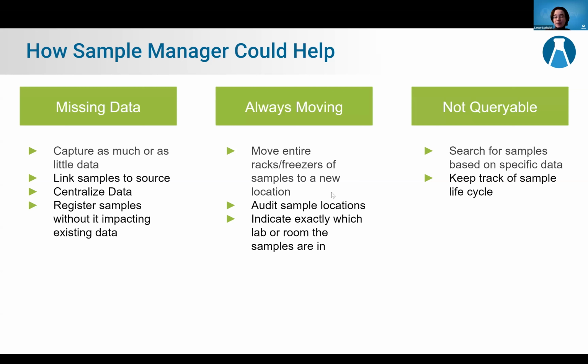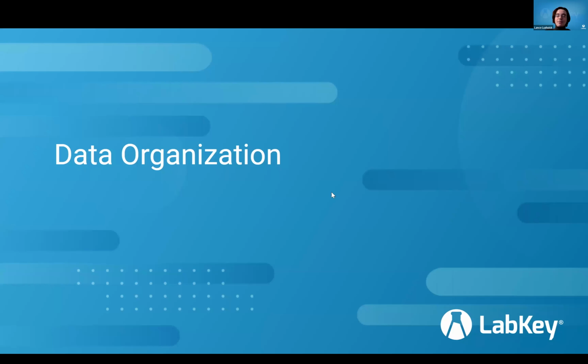So now, knowing how Sample Manager could have helped me and how it might be able to help you with some of your projects, how do you get there? And that's where spring cleaning really begins with Sample Manager. Step one of spring cleaning is data organization.